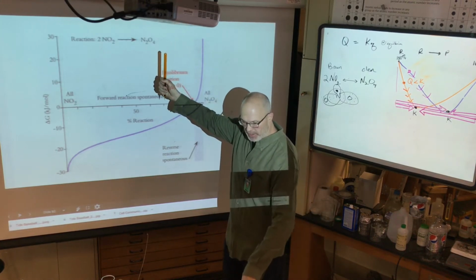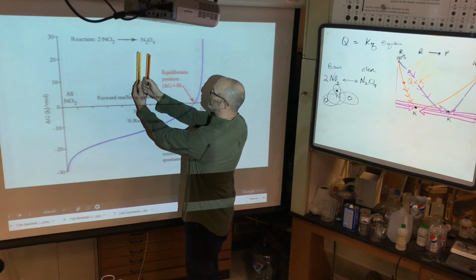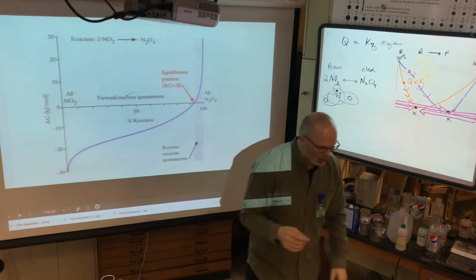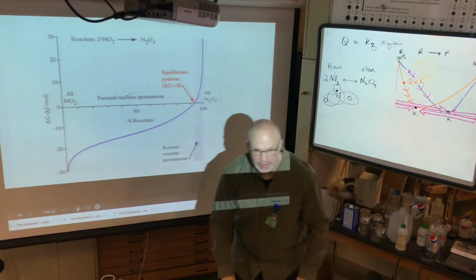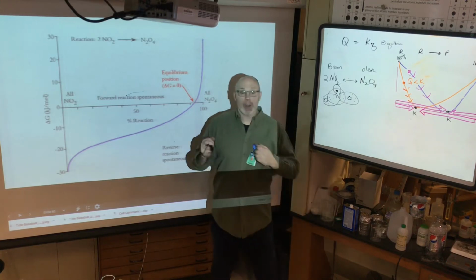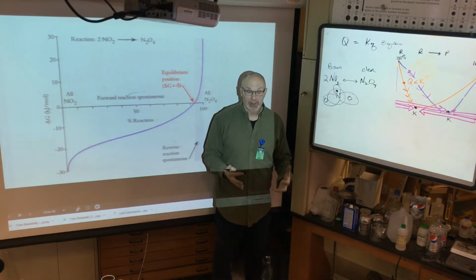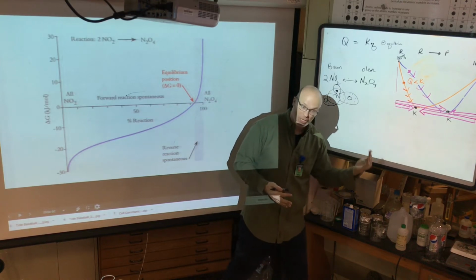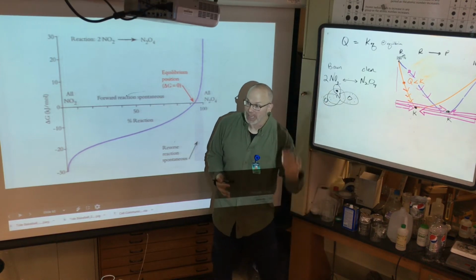This is ice bath. Who's lighter? Ice bath is lighter. So in the ice bath, did this reaction shift with the temperature? No, it didn't shift. What moved? K, Q. We didn't shift anything. We just moved the position of K. A shift does not occur with a temperature change.